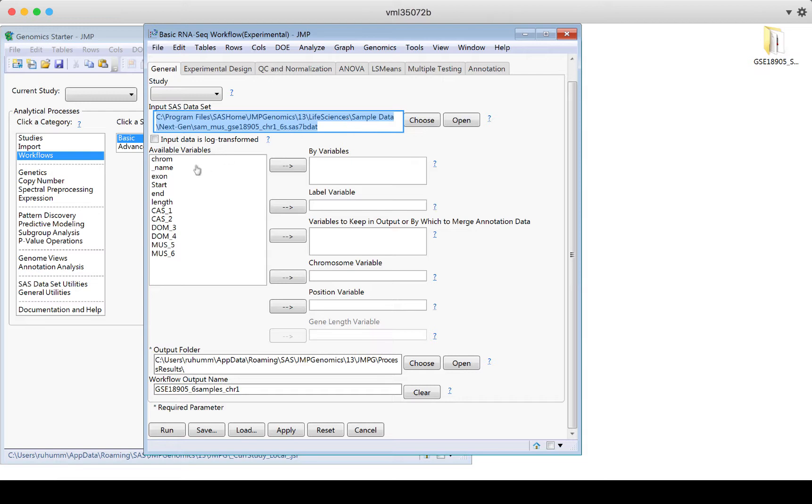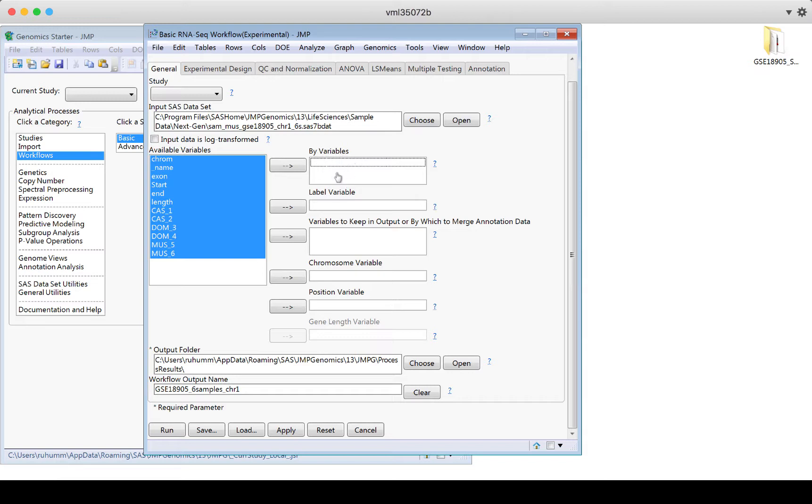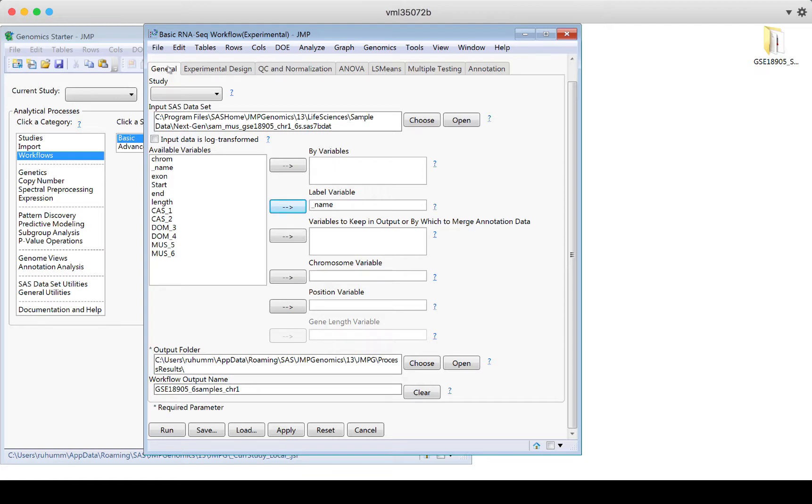And now it's showing me where this input SAS data set is saved. It's showing me the available variables. So this is a list of the variables. And I can now put them into roles to use in my analysis. So if I want to split my analysis out by something, I can put something here. If I want to label by something, maybe label by the name, I could add that here. If I want to keep variables in my output or merge them with annotation data, I can specify that here. If I have a chromosome variable or a position variable, here's the output folder where we're going to drop all my results. Here's an output name for my workflow.